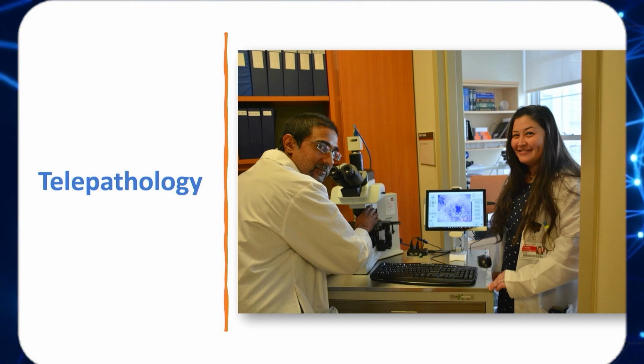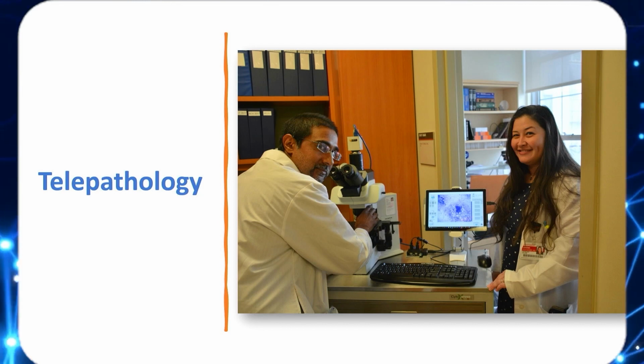I'm just showing you that our cytotechs are physically there. This is the structure. The microscope is there, but along with that, this image is basically projected onto the screen right next to it. This is for the benefit of the practitioner who's doing the procedure. If it's a pulmonologist, they want to know, what are you seeing? Because I can't have the cytotech move away from it to have everybody coming to the scope. So as they are driving, whoever is doing the procedure can take a break and come and take a look at it. It's usually the surgeons, they are really interested in looking at what is being obtained. So for their benefit, we have this screen available right next to it.